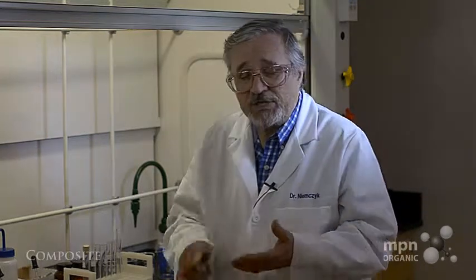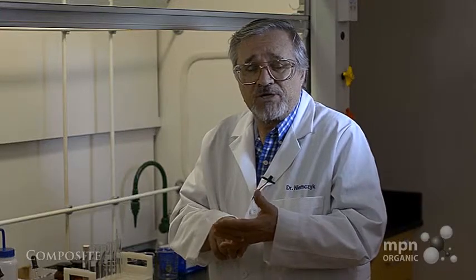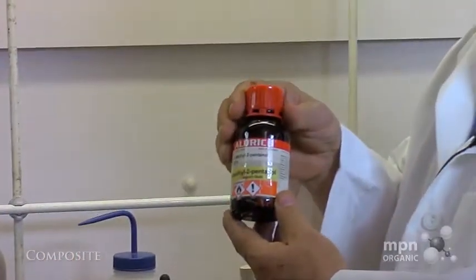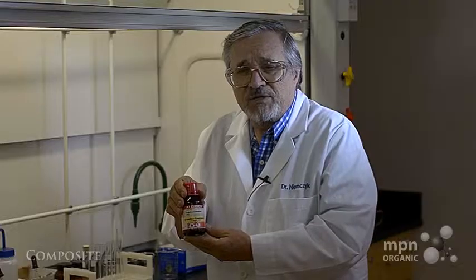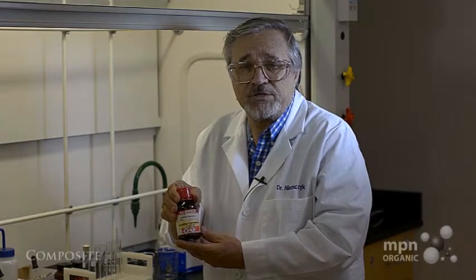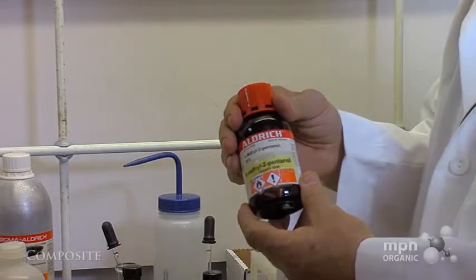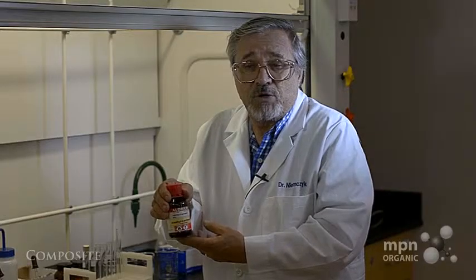And since we've already done the qualitative analysis determination of the oxidation of 4-methyl-2-pentanol, which I have right here, we say that it oxidizes up to a ketone, but does it really do that? This ketone, which is 4-methyl-2-pentanone, is, as I've said, a ketone. So will it give me a 2,4-dinitrophenylhydrazine test? In fact, it's a methyl ketone, so will this also give me a test which we call the iodoform test?